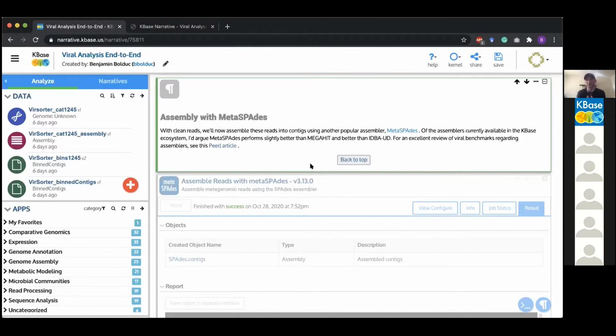It all really depends on your data type and basically the sequence complexity. So in that case, you could get just slightly less with Megahit, maybe like 99% of maximum. And the data set would require half or a quarter of the memory and would run 10 times faster.